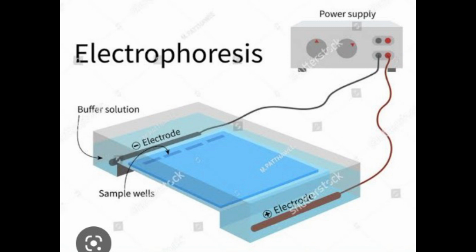A source of free radicals and stabilizers, such as ammonium persulfate and TEMED, are added to initiate the polymerization. The polymerization reaction results in a gel because of the addition of bisacrylamide, generally about 1 part in 35 relative to acrylamide, which can form a cross-link between two polyacrylamide molecules. The ratio of acrylamide to bisacrylamide can be varied for special purposes.